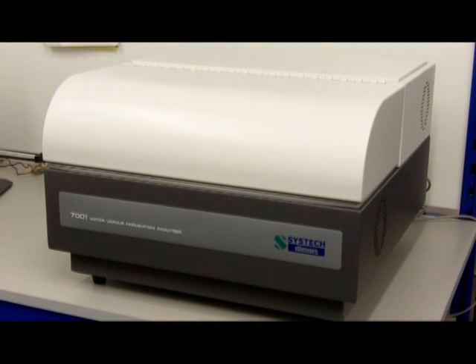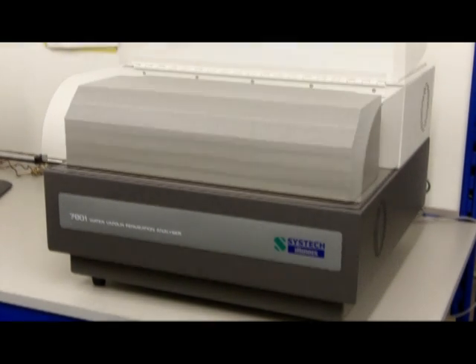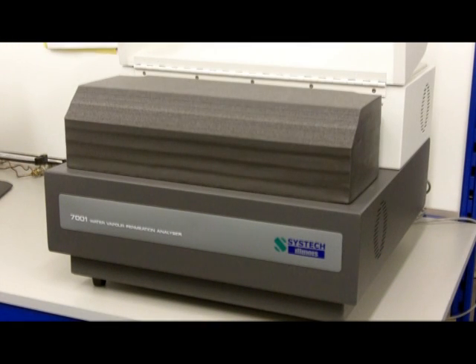This simple to use analyzer uses the most accurate and repeatable technology available and has been well proven by many of the world's largest organisations.